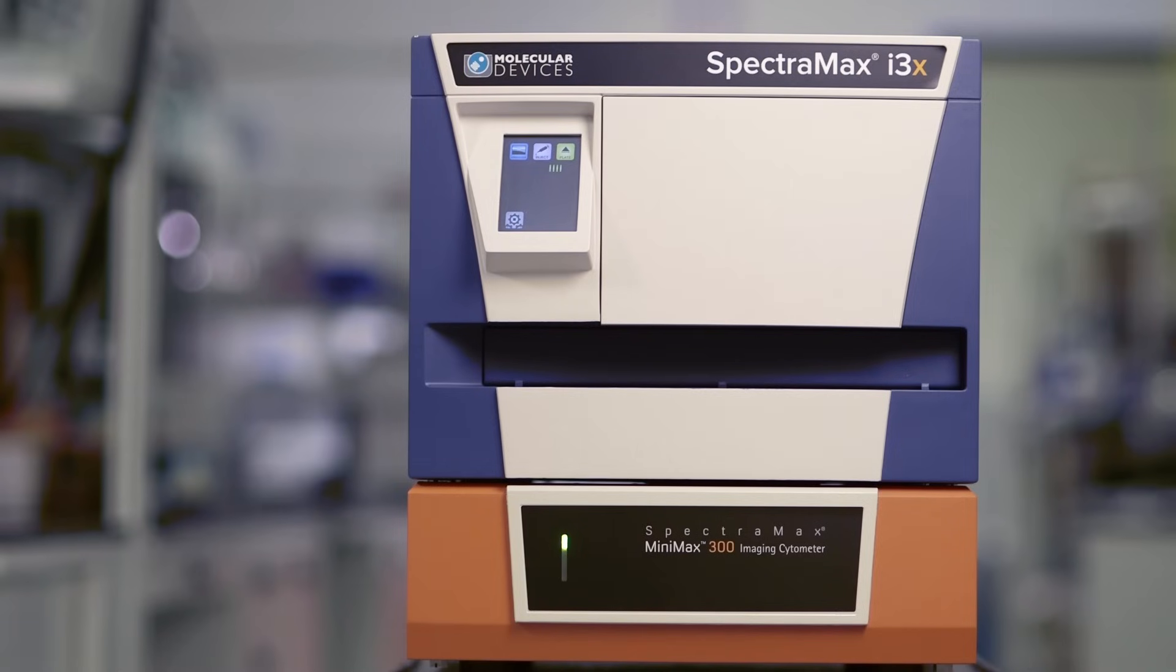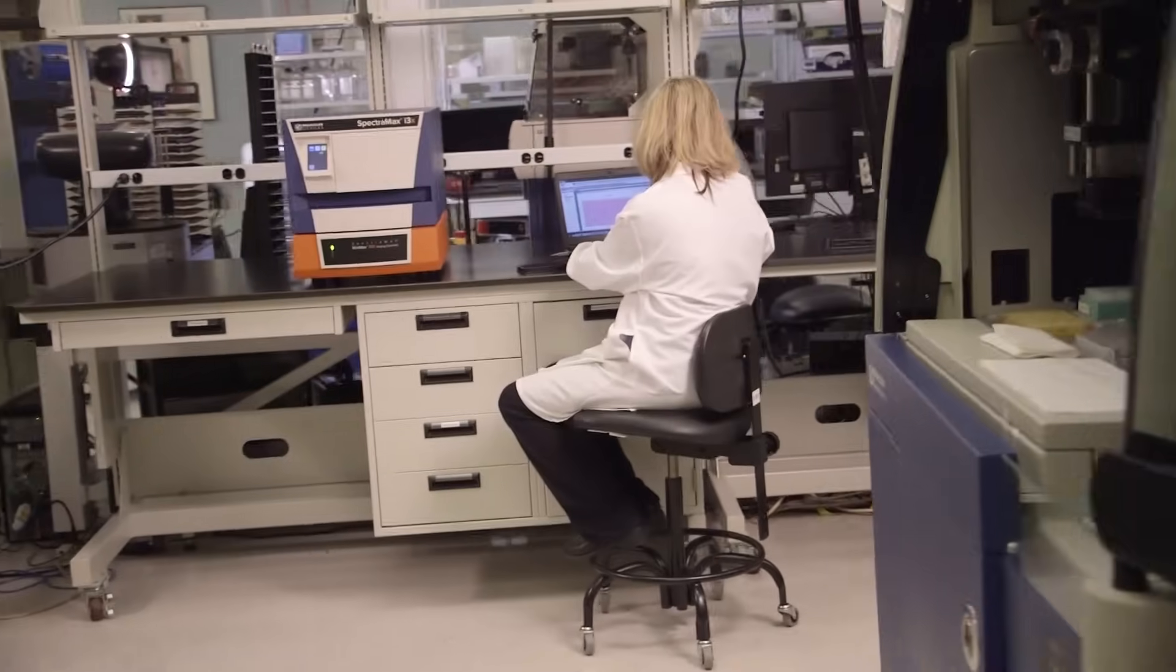Welcome to the future of lab technology. Meet the SpectraMax i3x multi-mode detection platform. It's not just a product, it's an investment in the future of your research.